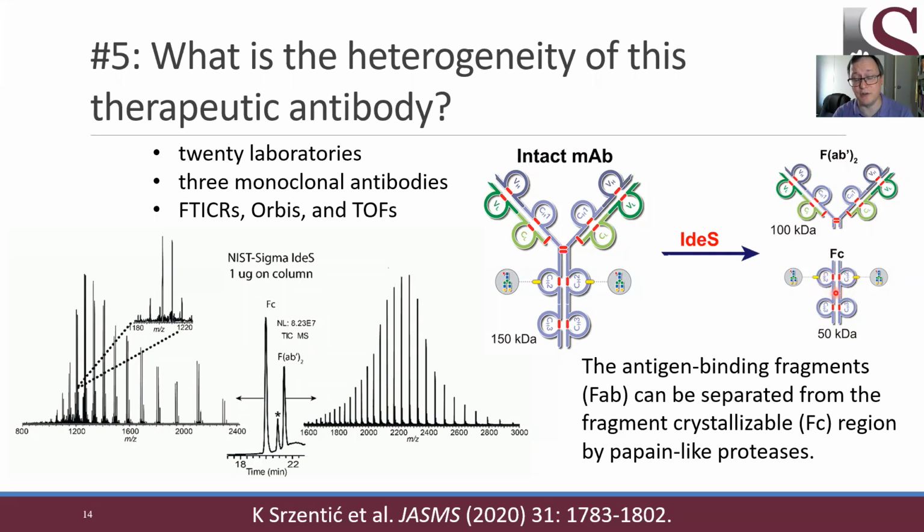And they were able to show that laboratories using all 3 of these technologies, a very wide number of 20 different laboratories, lots of different instrument operators, lots of different instruments, were able to use all of these different platforms to come up with useful information about how heterogeneous a particular therapeutic antibody was. I think that's beautiful work.